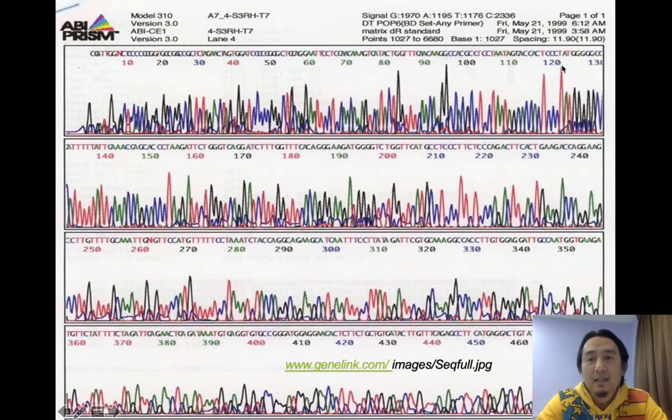Okay, so this one is also G, right? So this is the talk about the tall ones. So it confirms, maybe like 80% or 90%, the exact nucleotide position here. Okay, for the lower spikes, you can also be assured that the positions of nucleotide are correct.